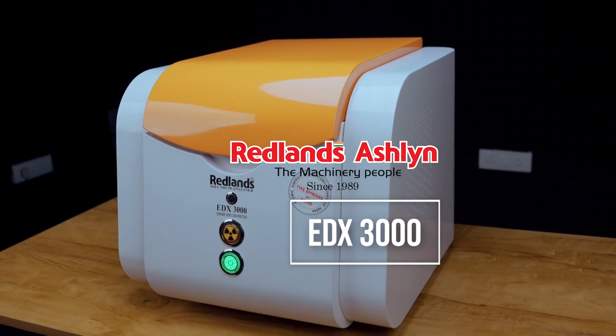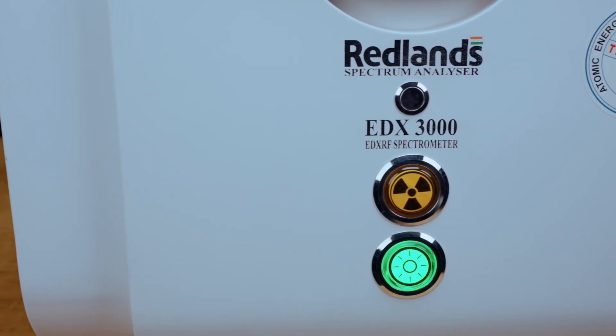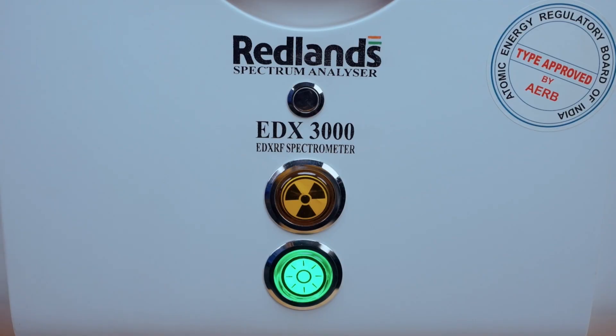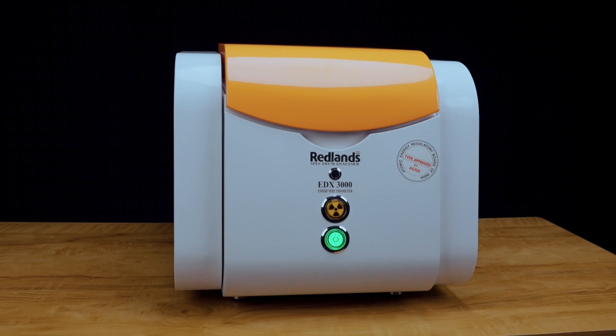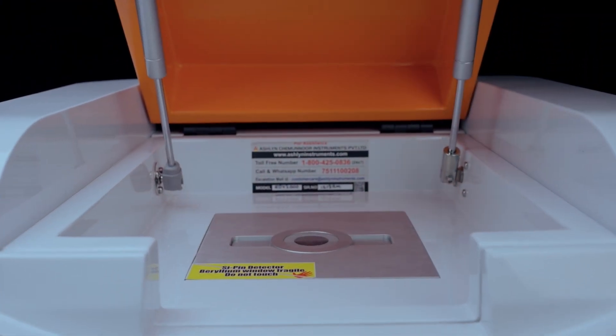Redlands XRF machines are the most accurate and globally accepted economical gold evaluation machines in the jewelry segment. Introducing the Redlands EDX3000 which offers customers the option to choose between multi-collimator or single-collimator configurations.